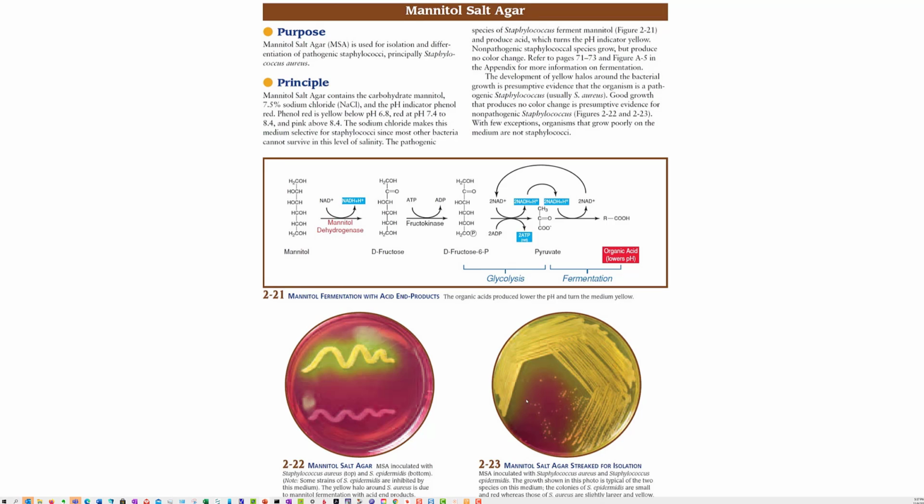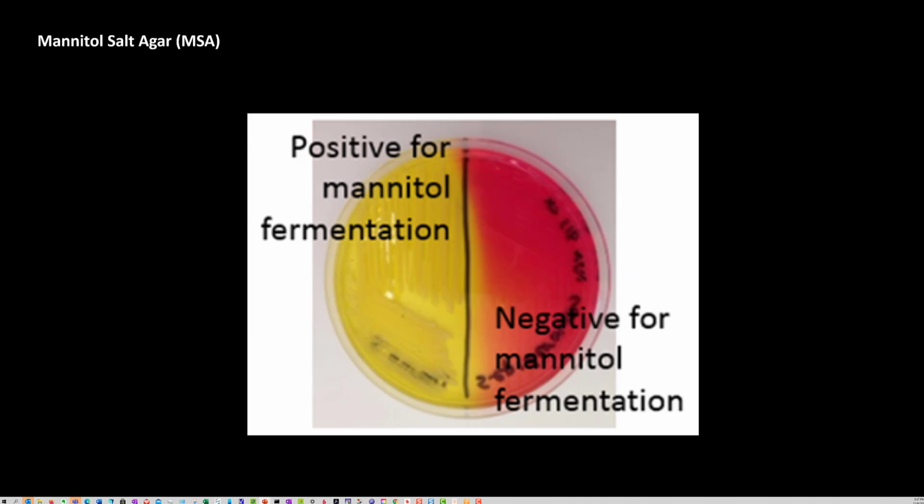And you notice the pH area, there's not enough microorganisms there to really change that pH, but the preponderance of it is obviously, and the same here. You can see that they both grow, but this one is breaking down mannitol, which makes it a great differential. So this has got Staph aureus and Staph epidermidis, and it doesn't break down the mannitol, and it's a nice differential for that. So it's a great, simple, easy, cheap test to run.